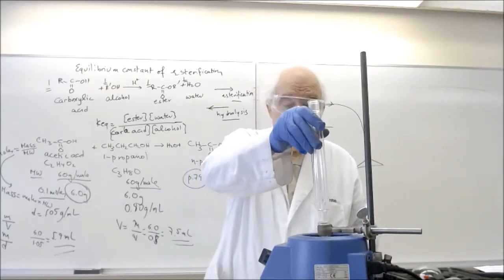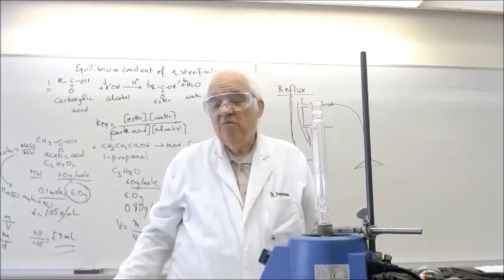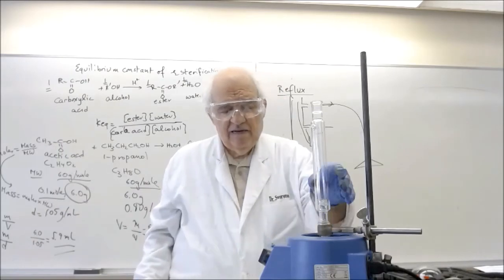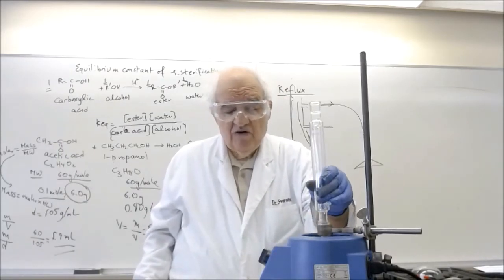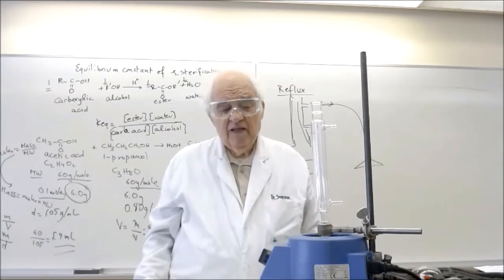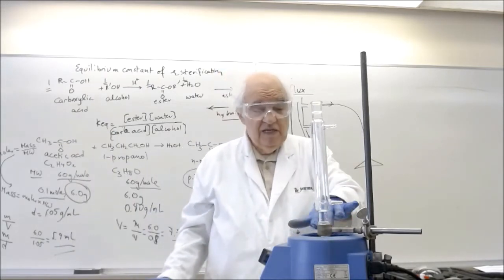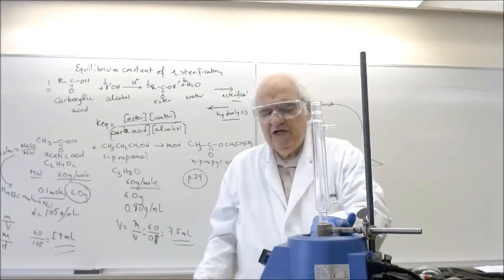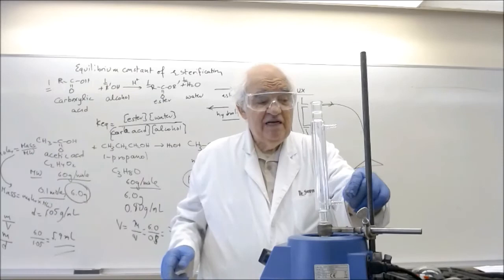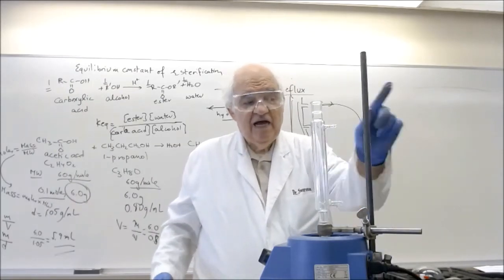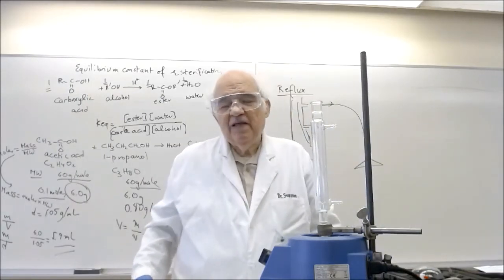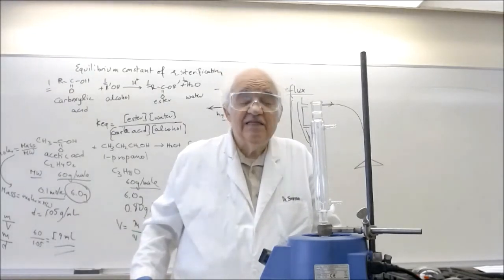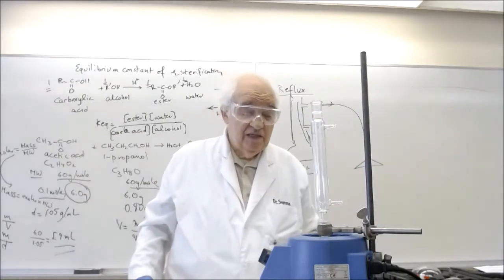Now what we do is we have to use a condenser. And when we put it here, so we will pour the liquids in here. And now what we're going to do is we're going to have the condenser. Again, remember now, whenever we have a joint situation here, what we do is we have a round-bottom flask. First we just touch the outlet of the condenser and then rotate it. And then in here you have the liquid and the boiling chips. And now you have the water in from the inside, out from the top. And we have to have a funnel tipped or hooked at the tip of the hose that is an outlet.